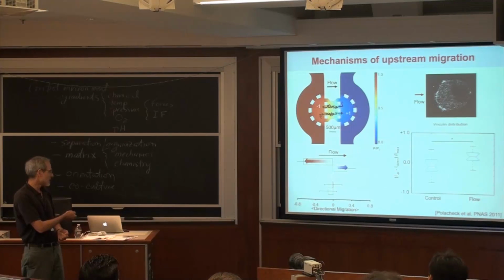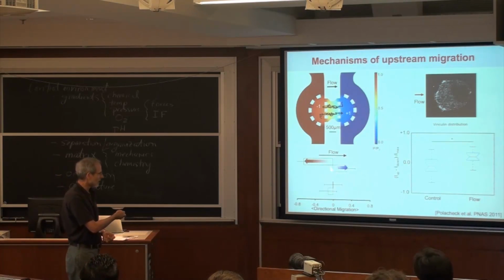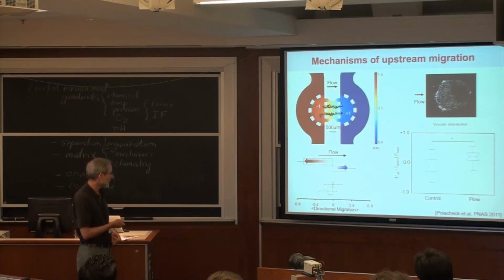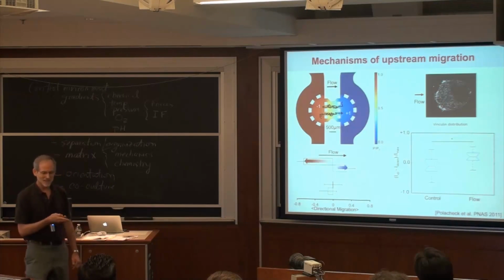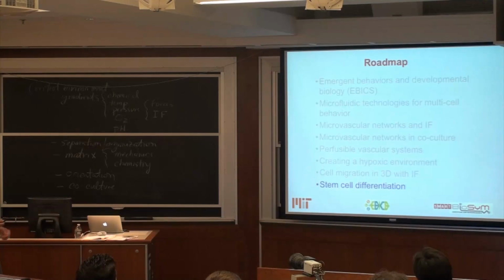The control case, and this is without the CCR7 blocking agent. So in that case, the autologous chemotaxis in this particular instance tends to win out a little bit, and the cells tend to migrate in the downstream direction. And this is just the control. I got that right, Bill? Okay. So that's what Bill's been up to, and that led to a paper in PNAS in 2011.